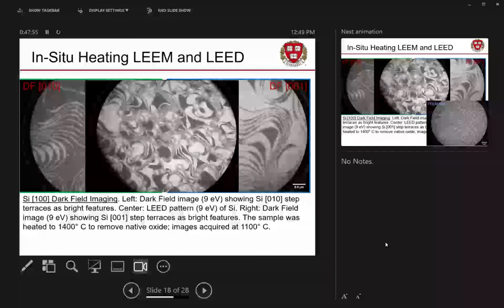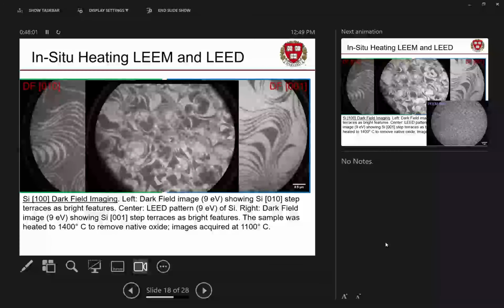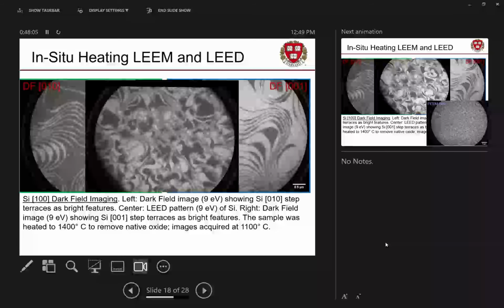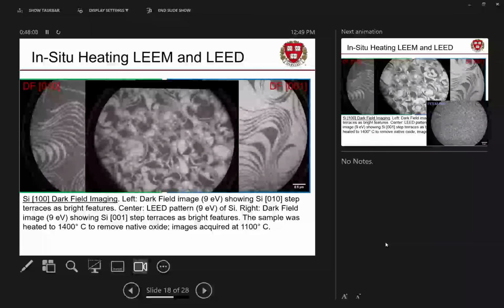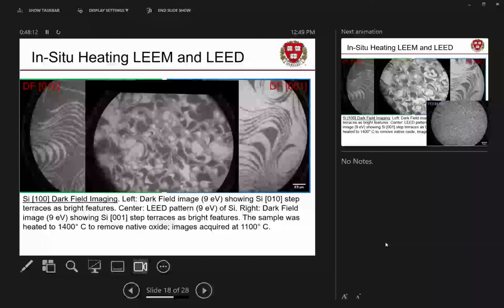So that's cool. If you hold this at 1100 and you just sit there watching it, you get something rather pretty. And remember, each one of these dark-light transitions is a single atomic step. These are single atomic steps of silicon moving around. A terrace is growing and reforming and so on. It's trying to flatten itself out. It's trying to get rid of steps because steps cost energy at this temperature.